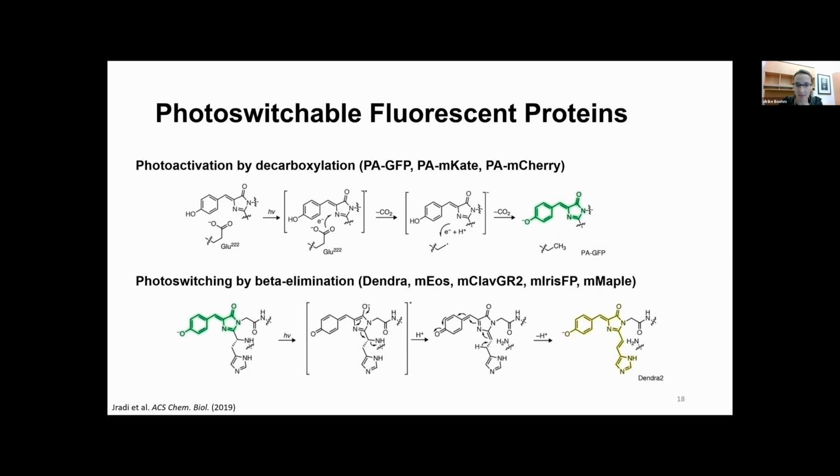Then another thing is, for example, that lots of people in the single molecule localization microscopy field also use the so-called mEos. As I've mentioned here, the transition doesn't happen from a dark to a bright state, but from one specific color to another specific color once you shine light of a specific color on these types of fluorophores.